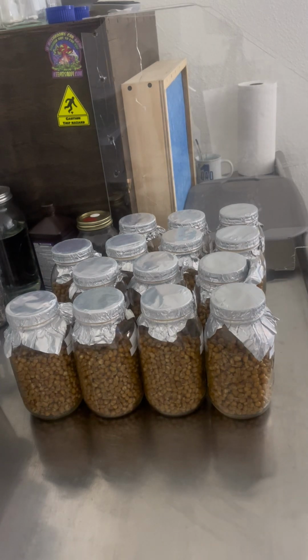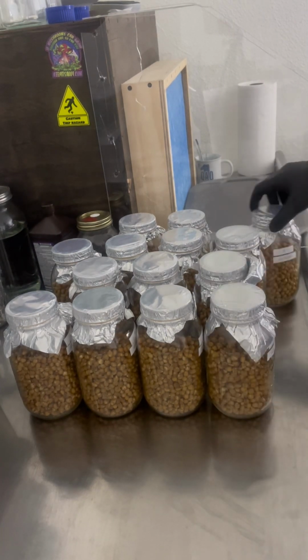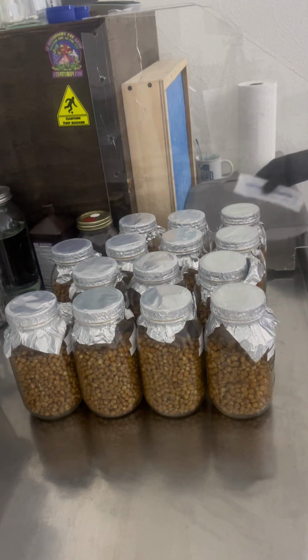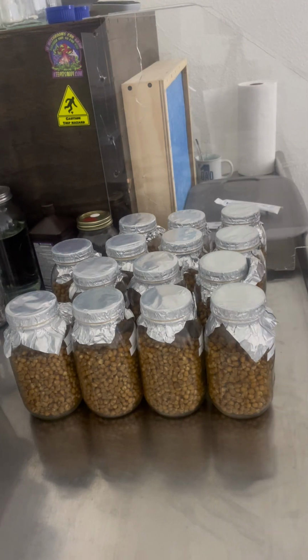All right, we got our corn all sterilized here. I put D on the drippy corn jars, and I put R on the non-drippy corn ones. I got 7 jars of each, and each jar has 460 grams of corn in it. So I'm going to put 5 cc's of LC from the same LC jar into each one.